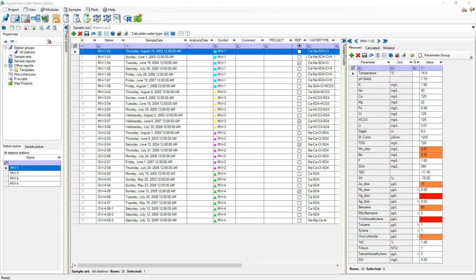But quickly in a nutshell, they're files that define different species, different elements, different equilibrium reactions. They provide parameters for the calculation of activity coefficients, parameters for things like dissolution and precipitation reactions. So you can imagine that these things are essential for running the PHREEQC model.